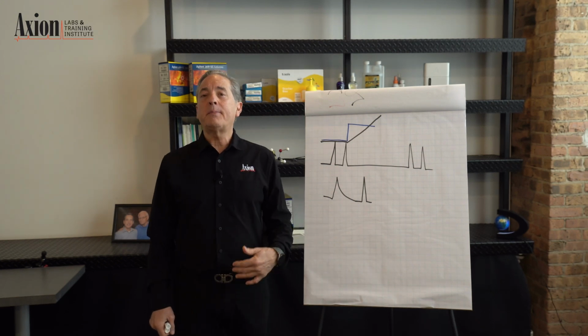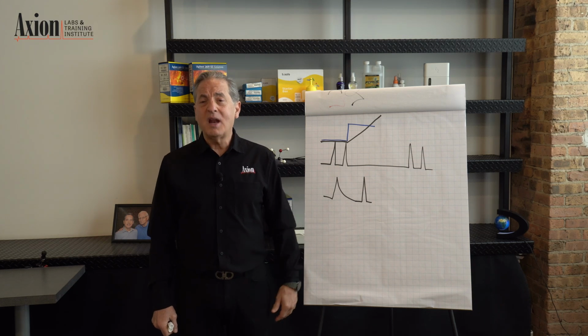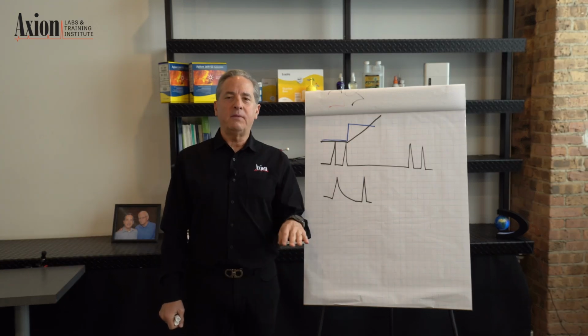And then step up to 100% organic, acetonitrile or methanol. Run it there, 100% organic, 1 ml a minute for 20, 30 minutes. At that point, you've cleaned everything off the column. There's nothing on the column. You should get a beautiful flat baseline.